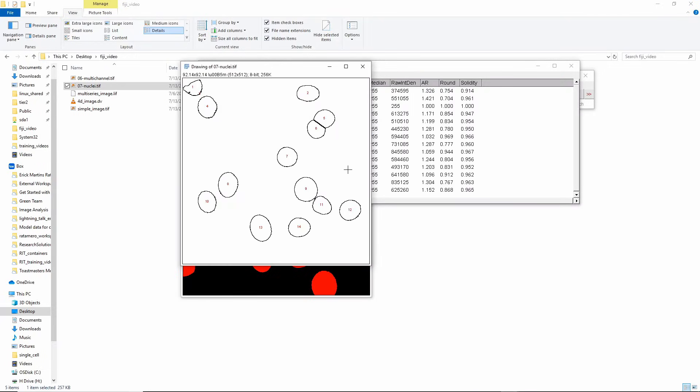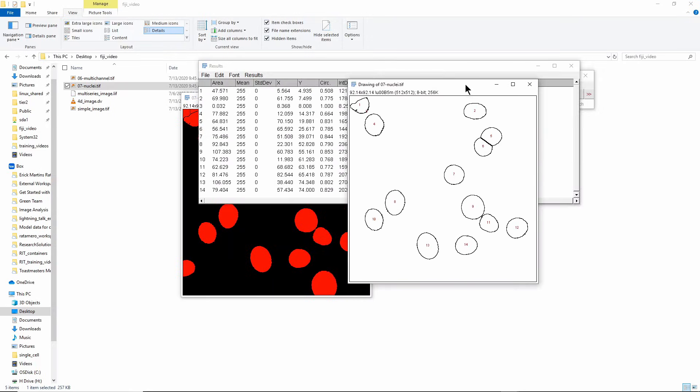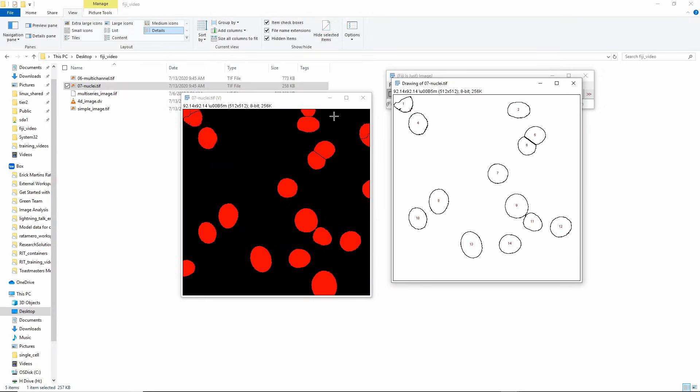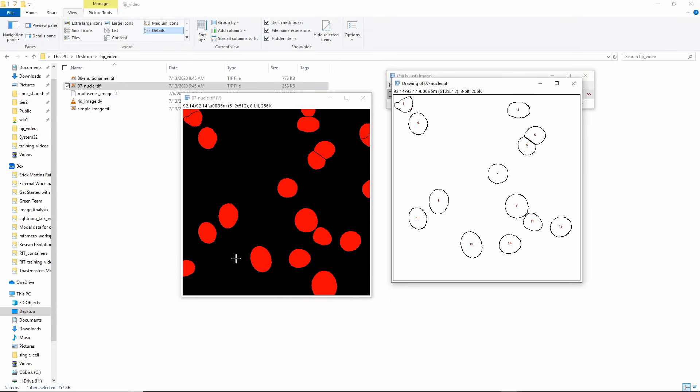Now if I redo the Analyze Particles with the same parameters, you'll see that now I get this region here that wasn't there because now it's not touching the edge anymore. It gets this region here which is these two, so it's only excluding the one that's actually touching the edge. It divided these two, it divided these two, you see they have separate numbers now. So this is already a pretty good approximation of what the objects are in the original image.